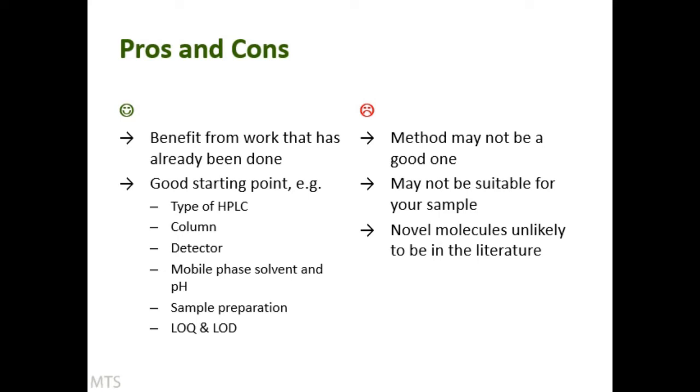Other downsides, it might not be suitable for your sample. And if you're working on something quite new, it's unlikely that that will be in the literature. So you're working from scratch. But this bit's quite interesting here. So I would say even if you don't find a method, it is a very good starting point.